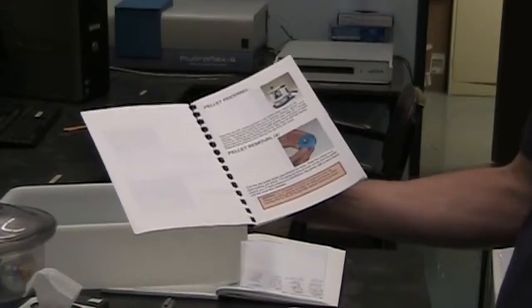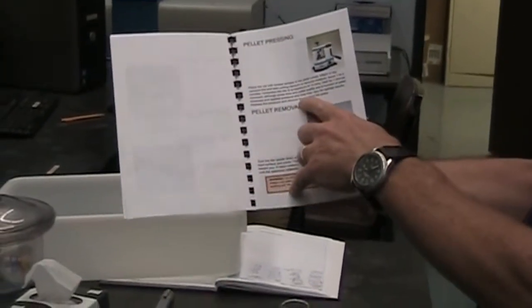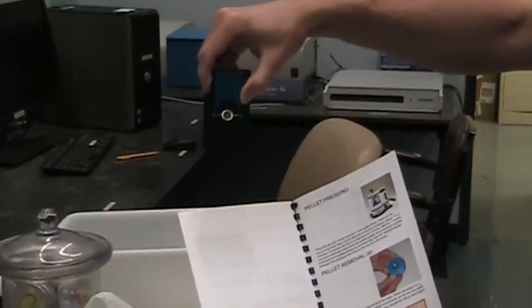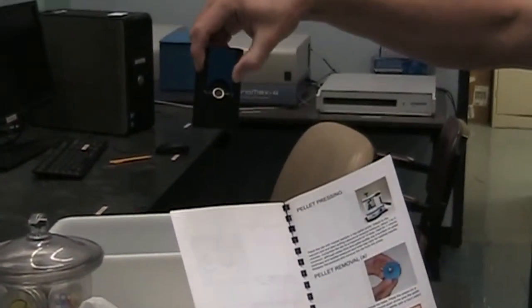Pellet press, we use the one in the advanced synthesis lab next door. Getting the pellet back out, and then I've already shown you, or I will show you in a second, how to present the sample. But again, the press that we have is just the right size. It'll make samples that'll fit nicely into our sample holder.